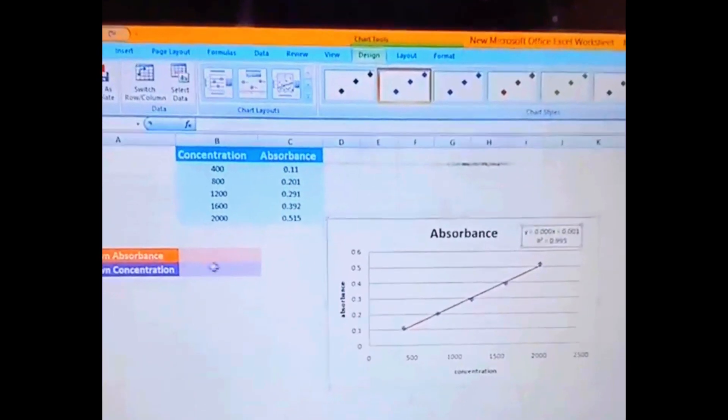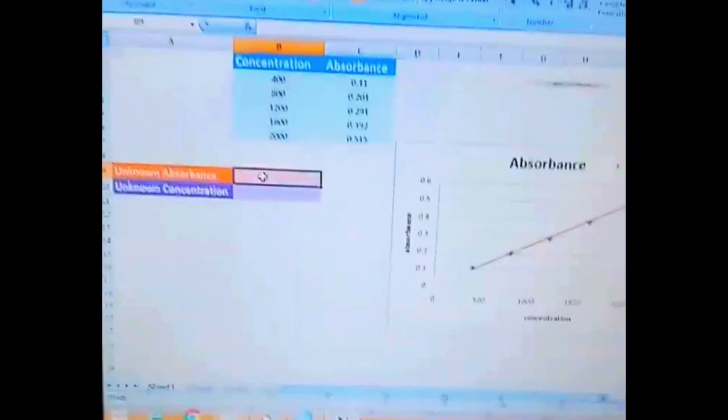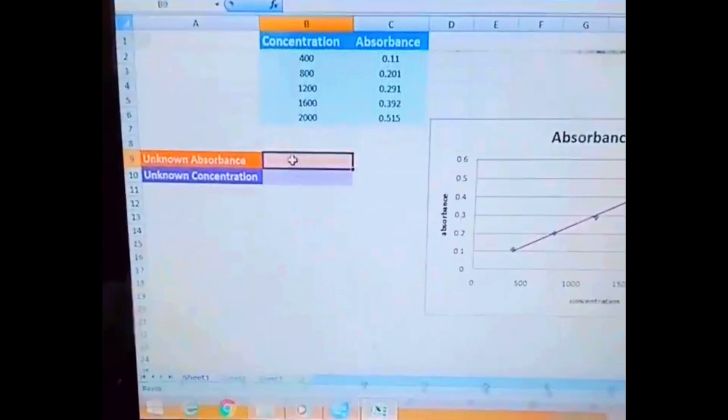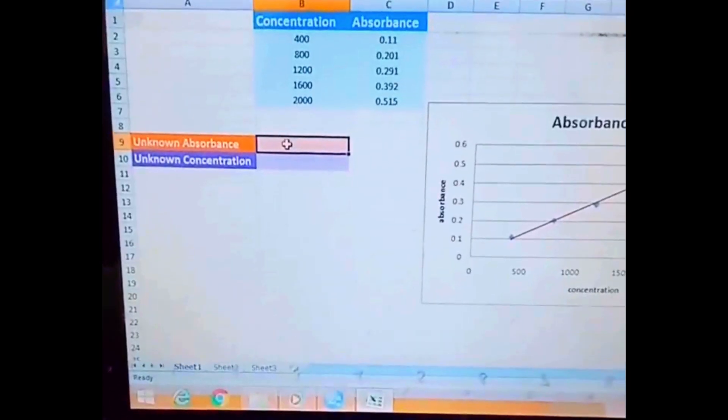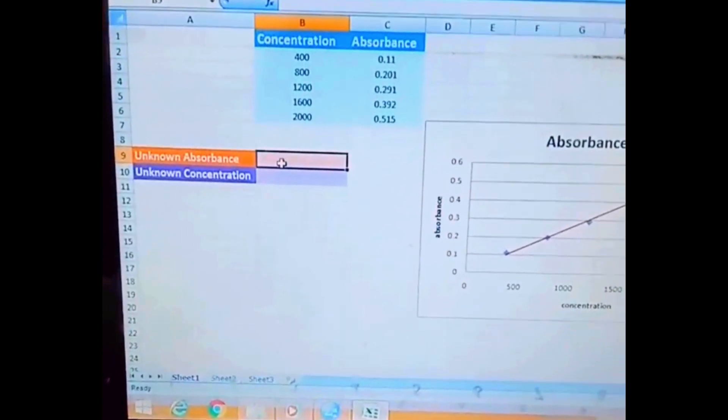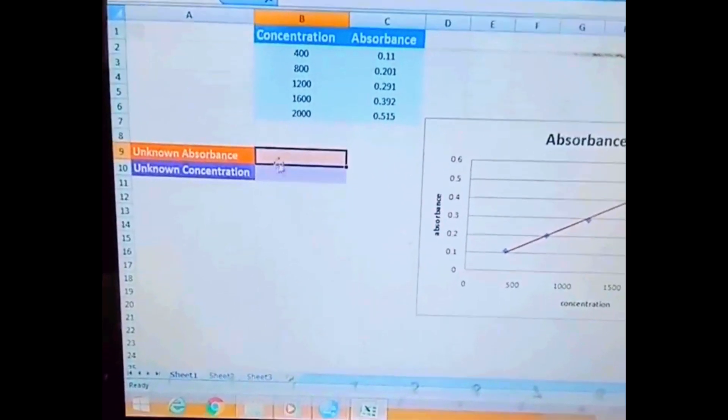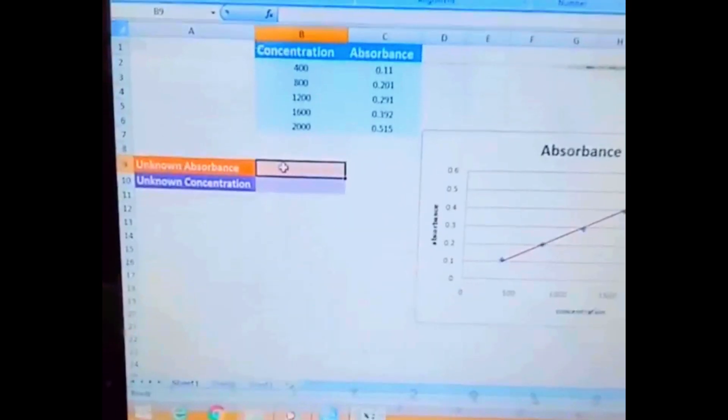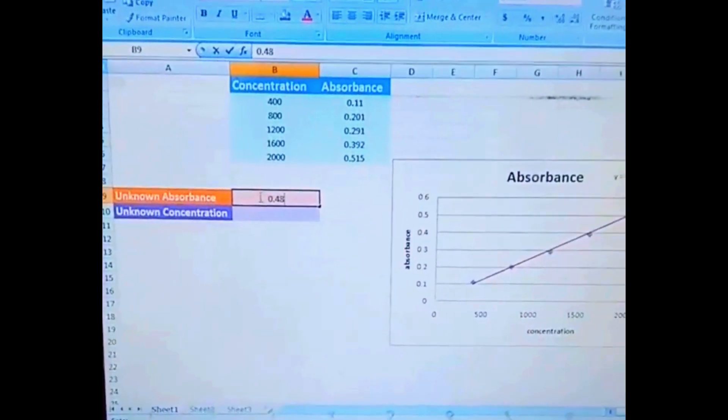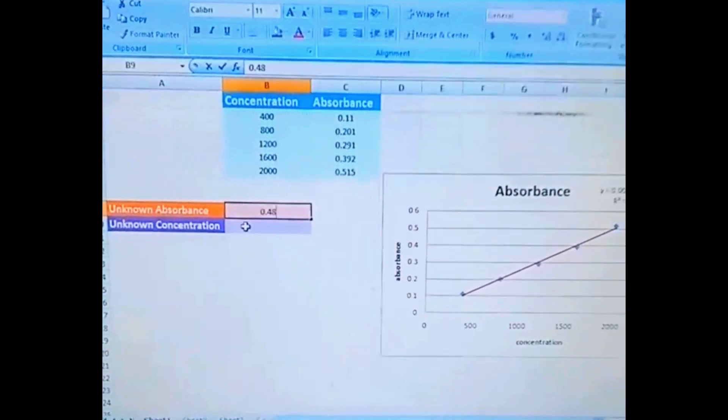This thing you know very well. Now the unknown absorbance we have to calculate. This value comes from the experiment. Whatever value you have, you can put it here. For example, I'm putting here 0.48, absorbance of the unknown test sample.